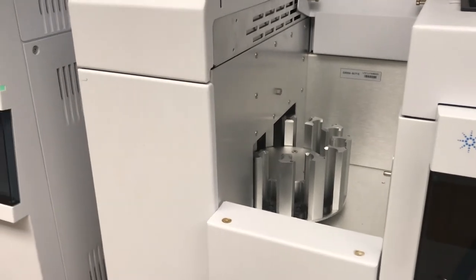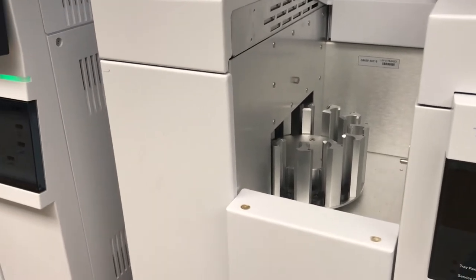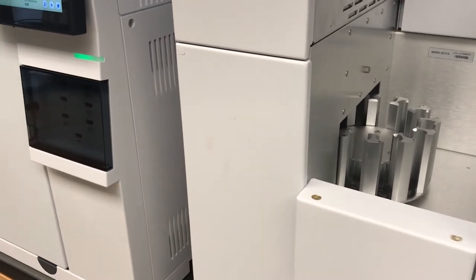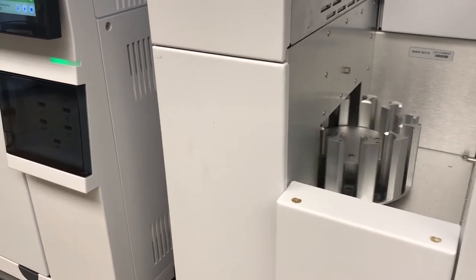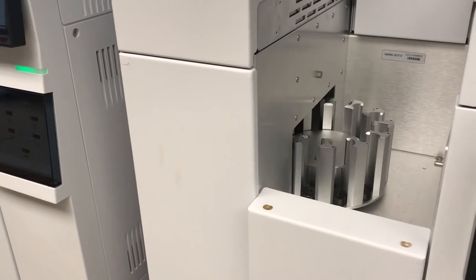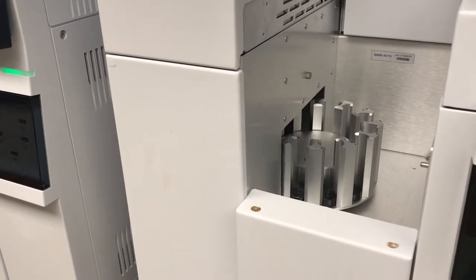Here's what the autosampler looks like. It's got a 12-position carousel.